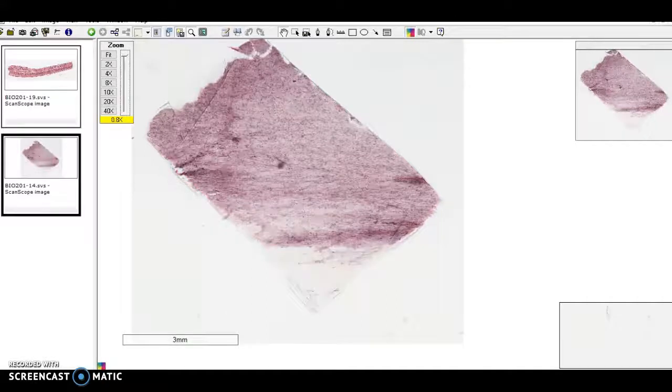Areolar tissue. Areolar tissue is an example of a loose connective tissue. Loose connective tissue, that term means that the fibers are loosely arranged, usually randomly, in the tissue. Areolar tissue surrounds blood vessels. It underlies most basement membranes and epithelial tissues.